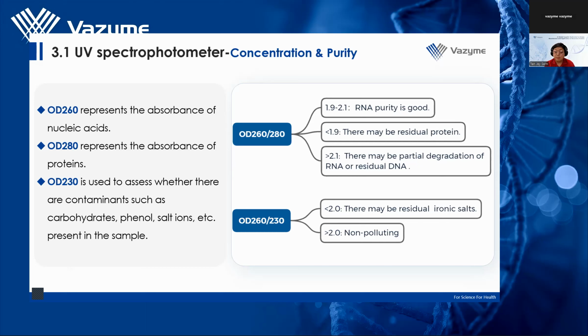from reagents. Now, it's worth noting that even though the OD results are not optimal, if the concentration is still decent, the RNA may still be usable downstream. If subsequent experiments have low impurity requirements, such as reverse transcription, quantitative PCR, or RT-qPCR, the experiment can still proceed. Many modern reverse transcription reagents exhibit strong tolerance to RNA impurities, and even some of our kits help to remove any contaminants that might still be in there. All right, just to share.